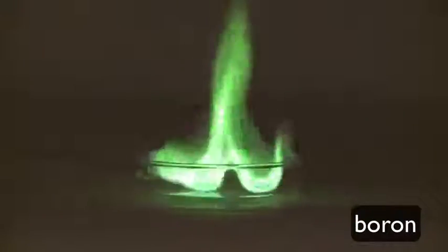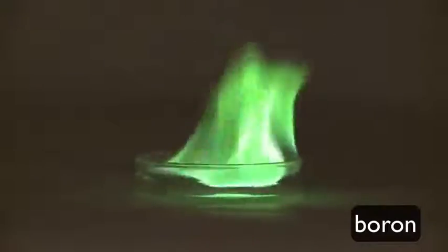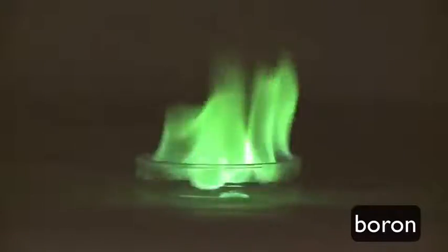The last sample is boron, which also emits a green light as it burns. In this case, the boron is in the form of boric acid, which is dissolved in the methanol.